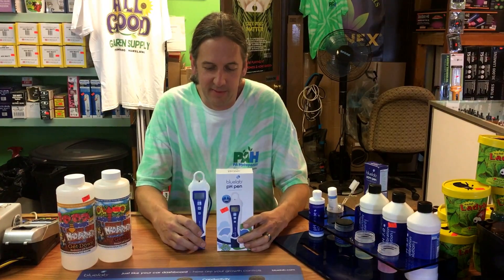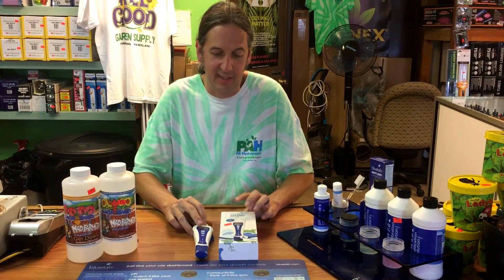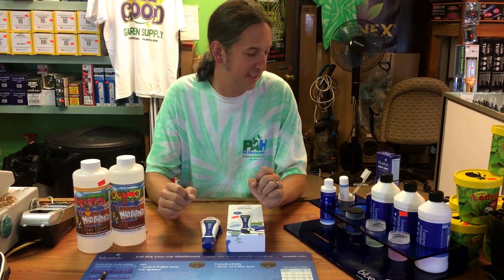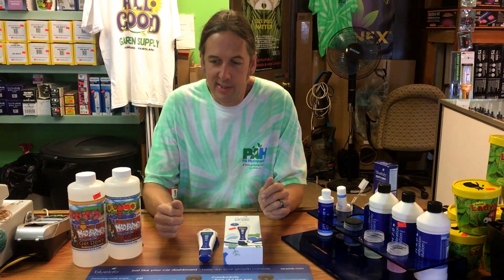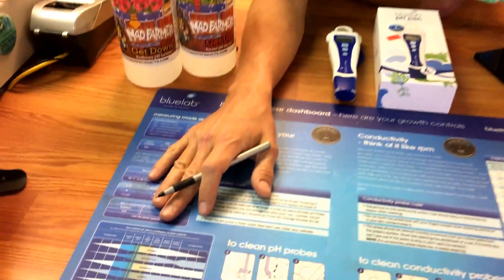Today we're talking about pH meters. This is definitely something a lot of people ask about in the store — we sell a bunch of different models. pH is very important to plants. Even Wikipedia says it stands for 'power of hydrogen,' though there are multiple references. A pH meter measures how acidic or how alkaline your water or nutrient solution is.